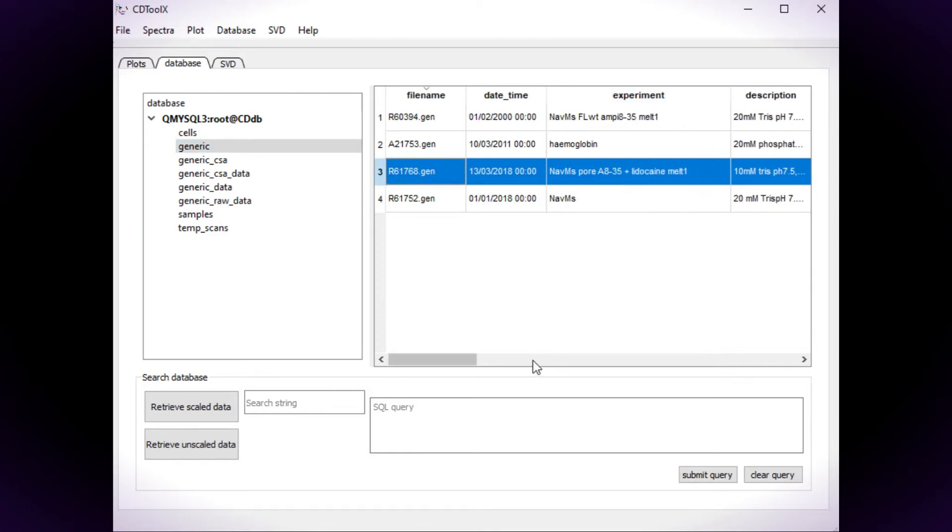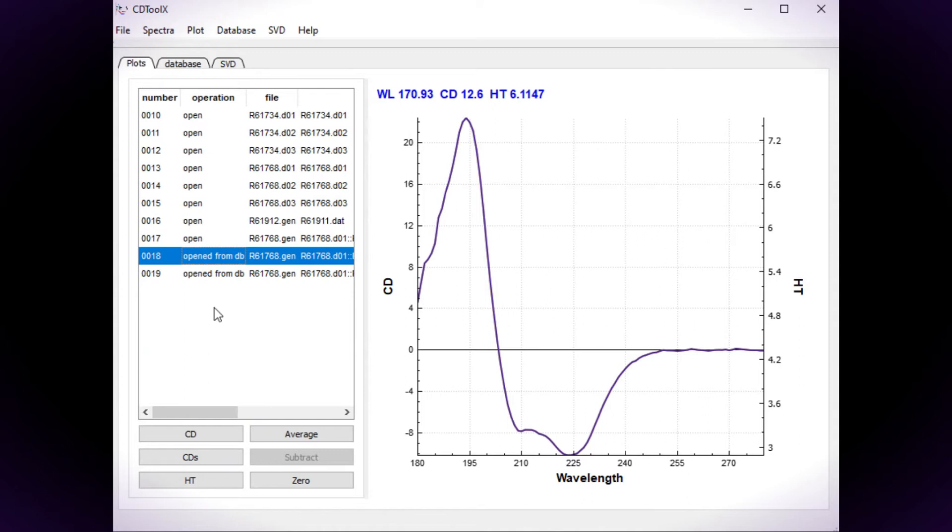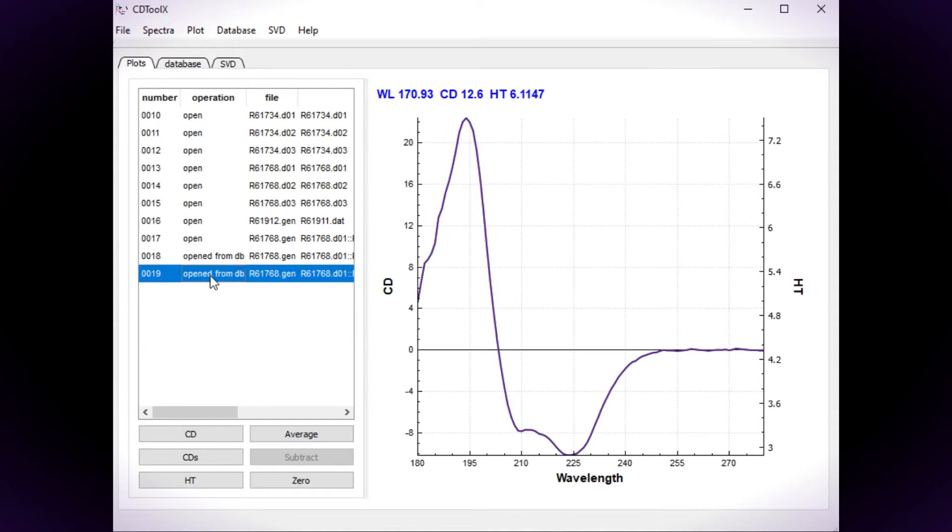To retrieve the spectrum, select the spectrum from the database table and click on the Retrieve Unscaled Spectrum button. The spectrum is displayed in the plot window.